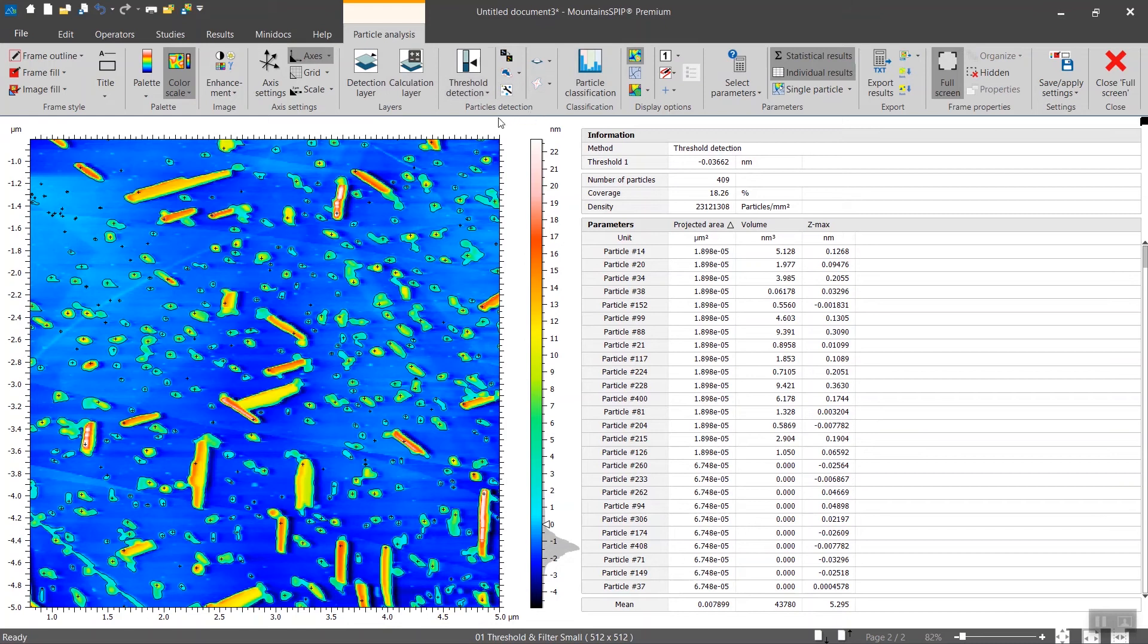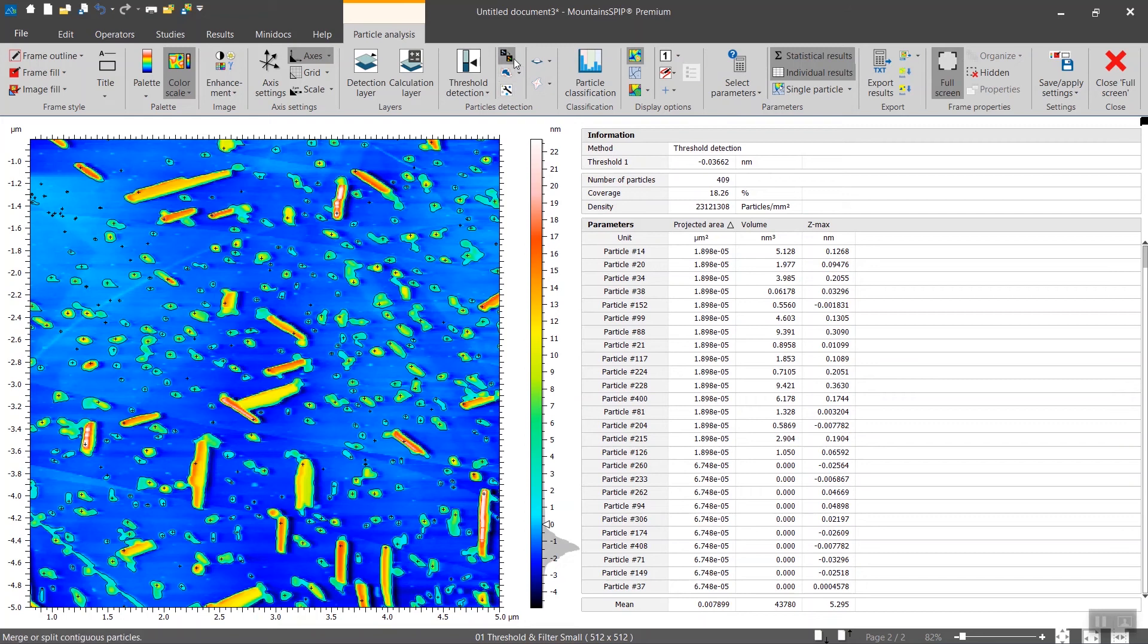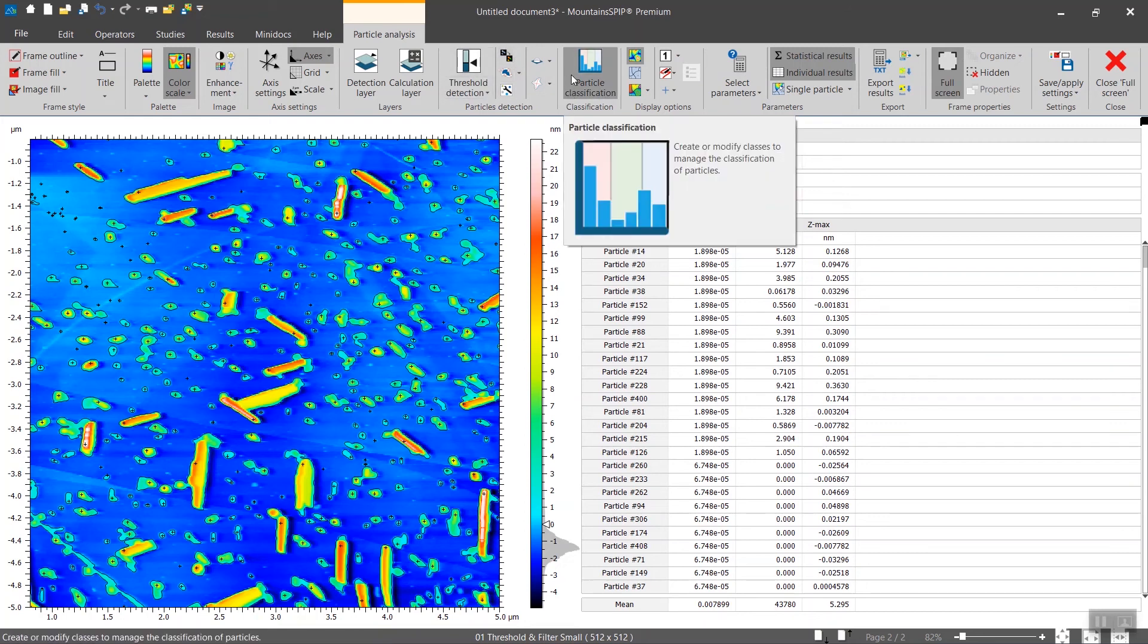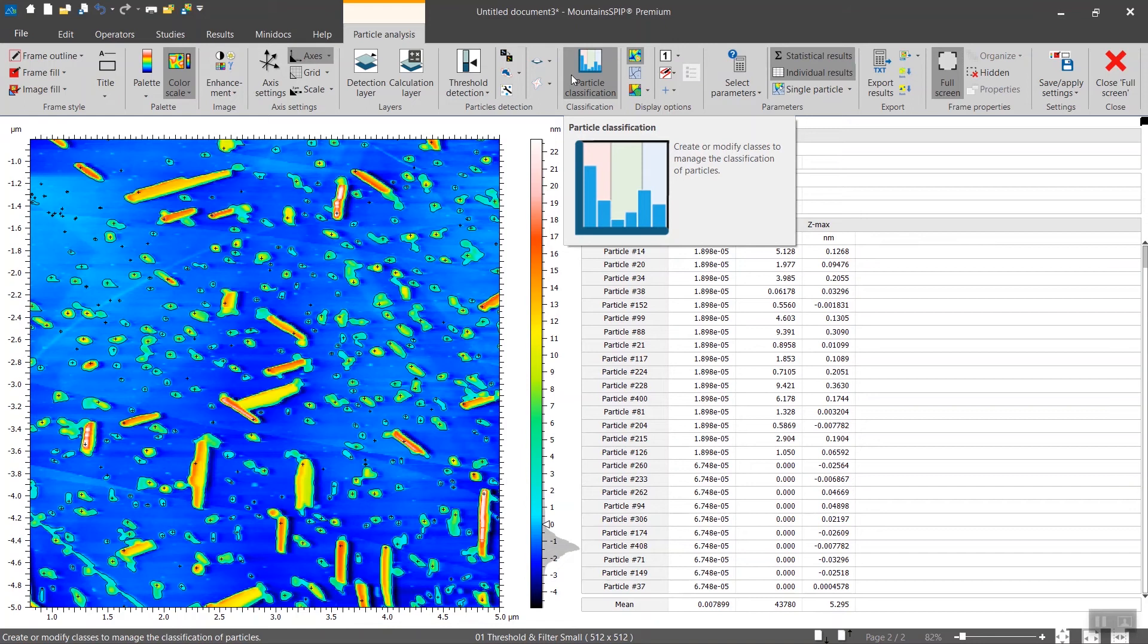Particle detection - that's where you will select the method of detection and refine the detection. Classification - you will be able to sort particles based on any number of parameters calculated or their combination.